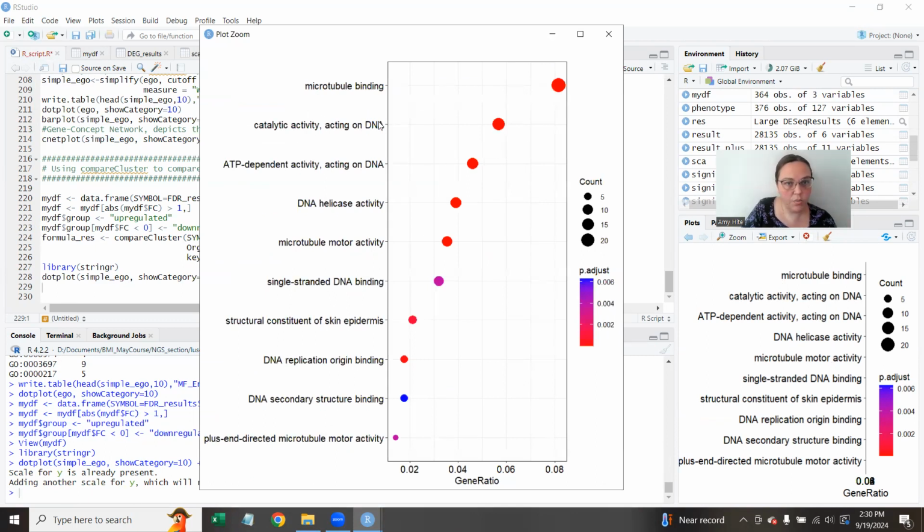All of these are one single line, and all of this information over here looks really nice. So if you were to print this to a file, you could make the height of your picture shorter because these names are not taking up multiple lines of space. So you could think about, what does the size of my plot need to be? And if you want to stretch out your gene terms, it makes it look a little bit nicer.